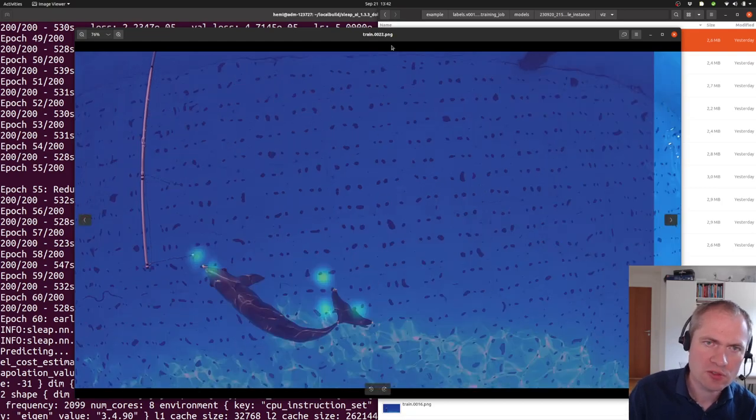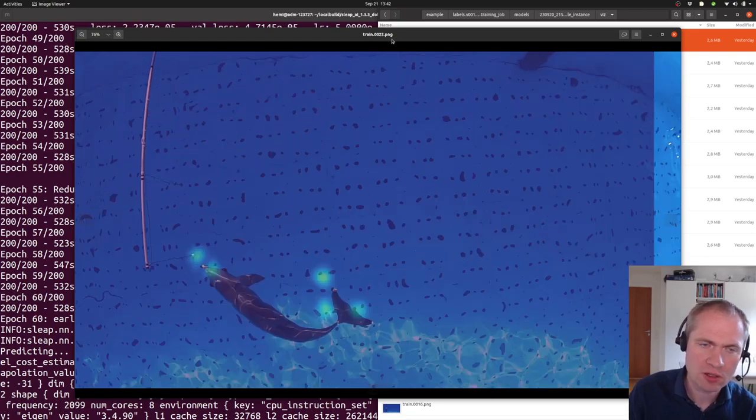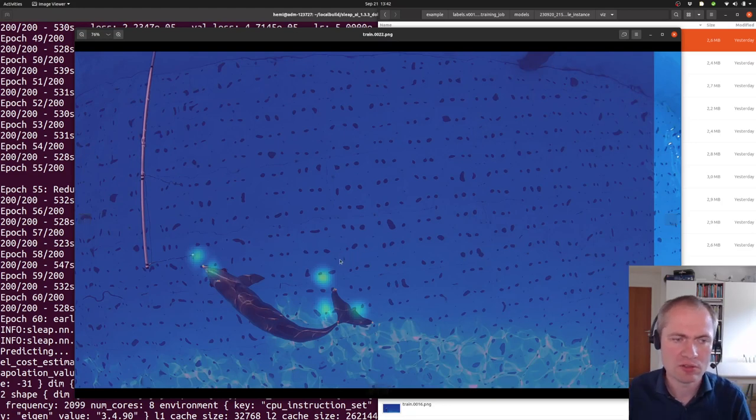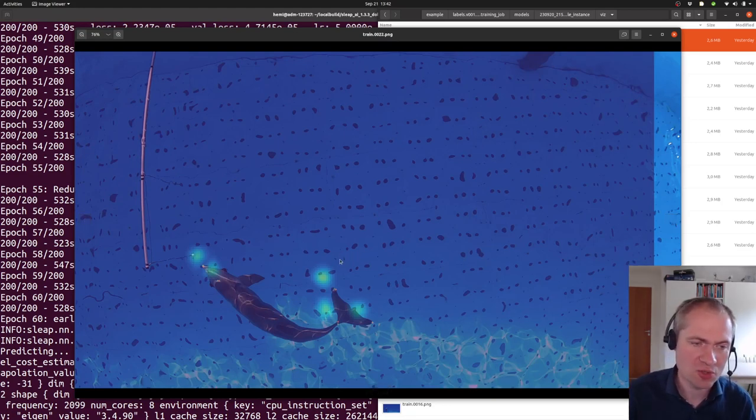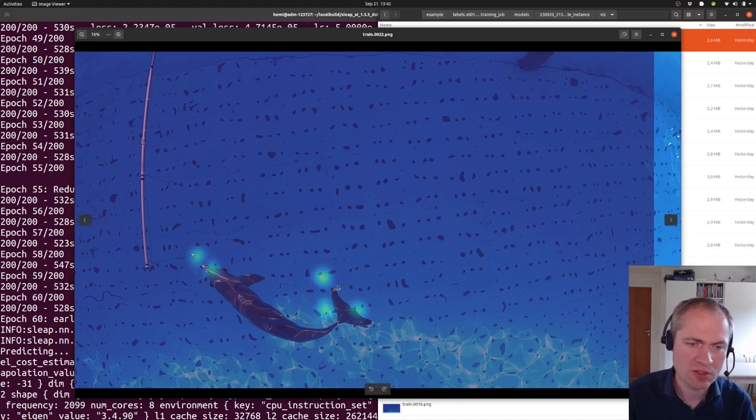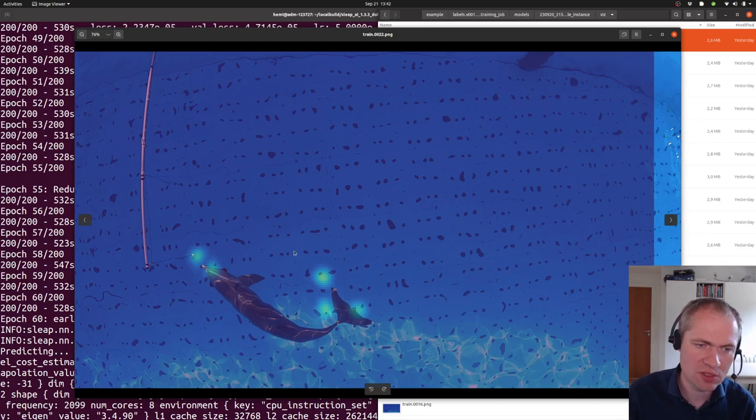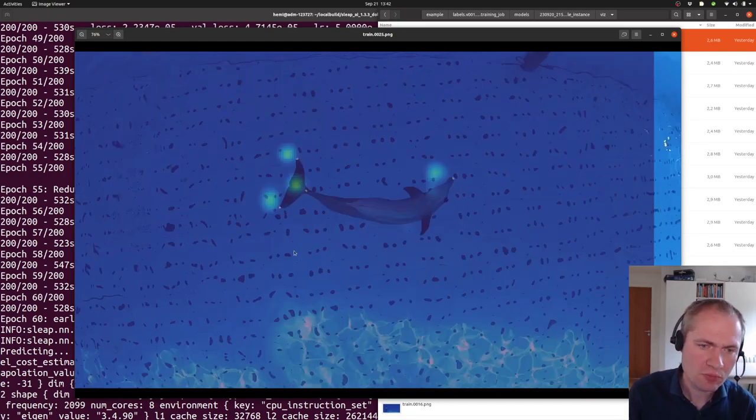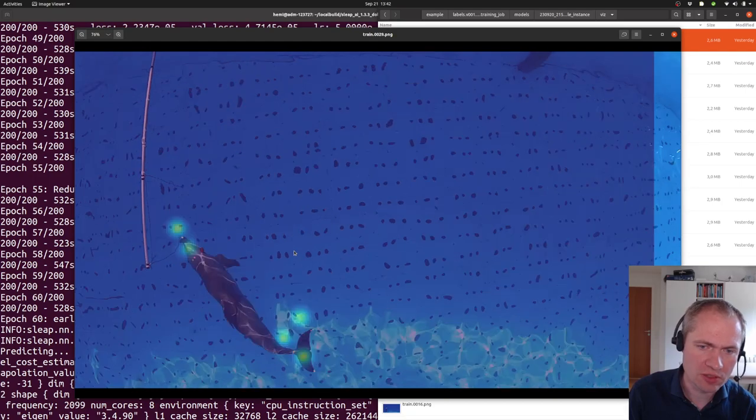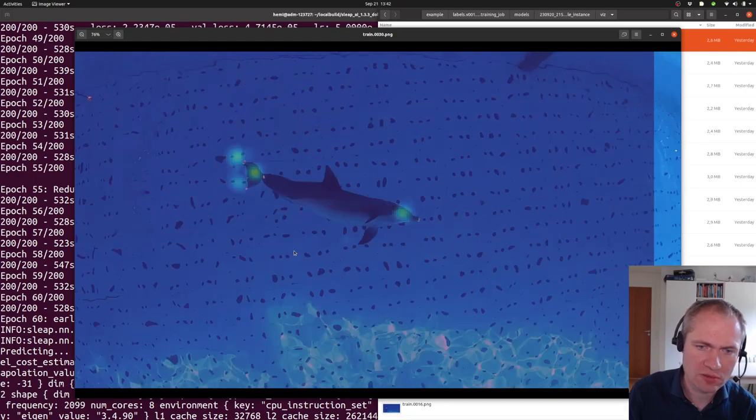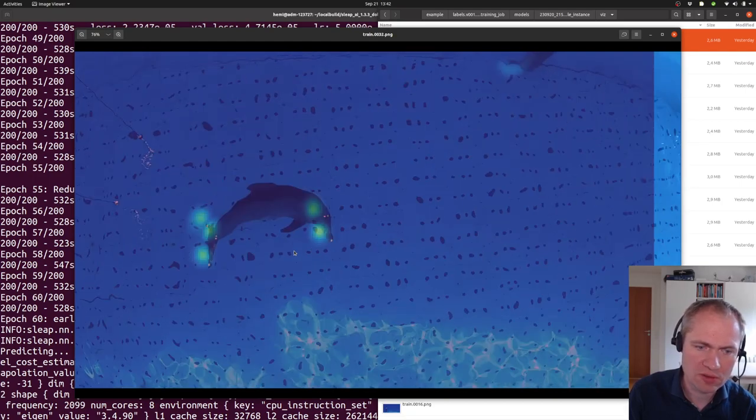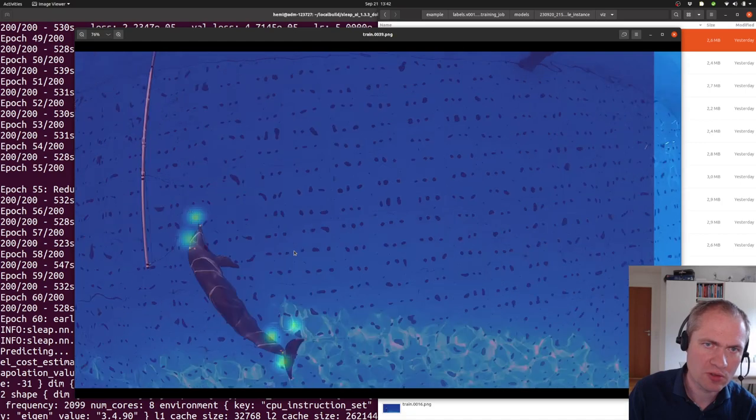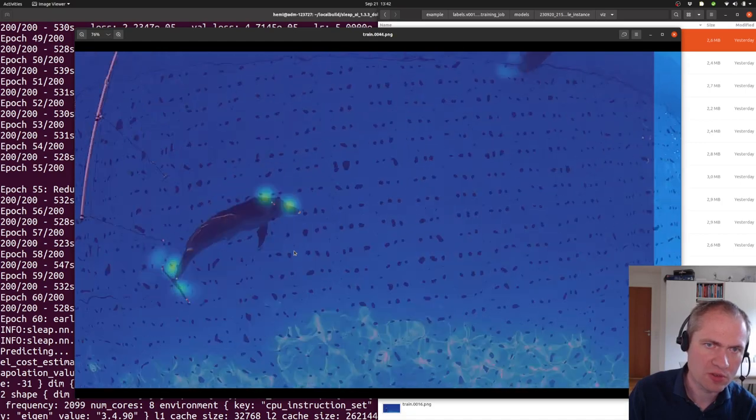The parts that are denoted train and then a number afterwards are samples that the neural network actually sees during training. So we will expect to get more or less perfect in recognizing the position of these landmarks.